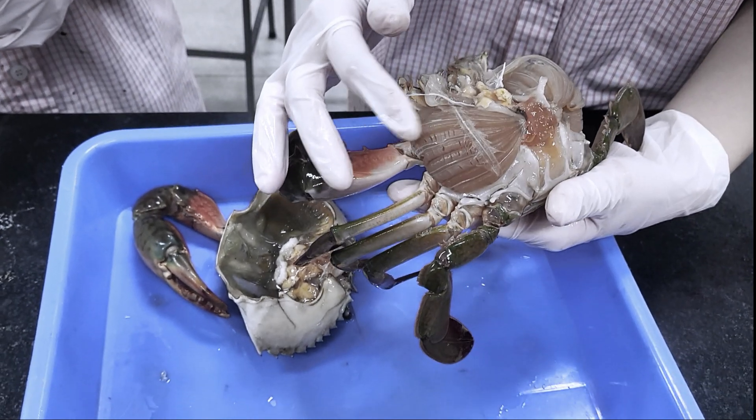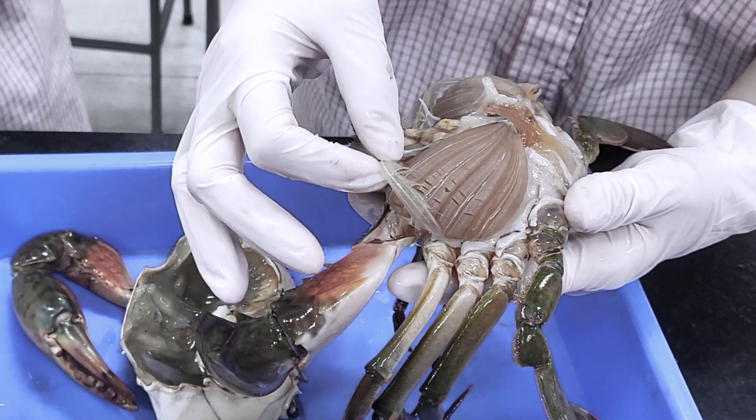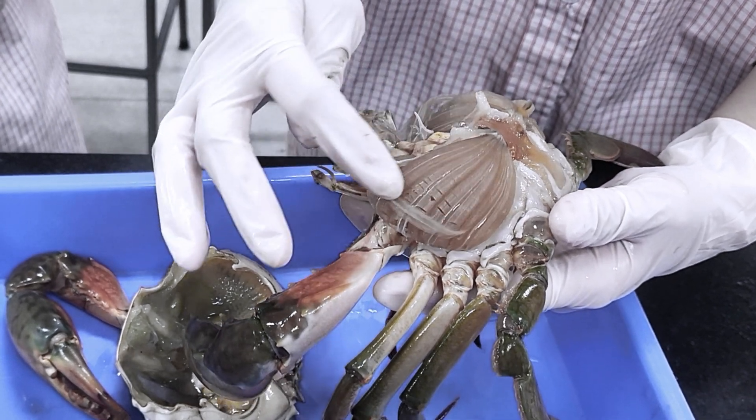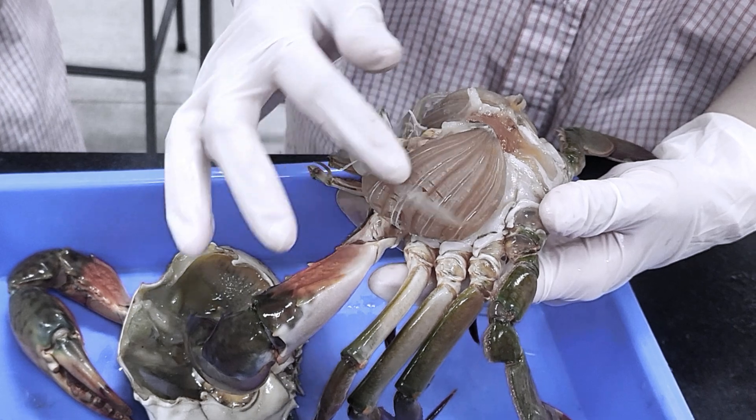On the other side, we can see the crab's gills. The flabella, which sweeps over the gills, keeps them clean. The second and third maxillipedal flabella clean the inhalant side of the gills, while the first maxillipedal flabellum cleans the exhalant side.